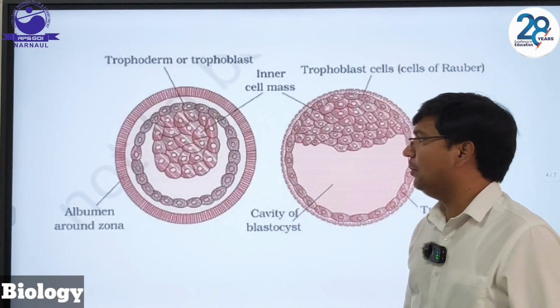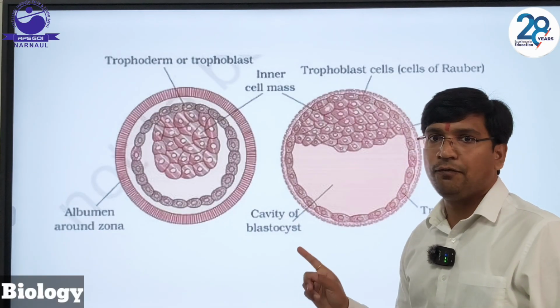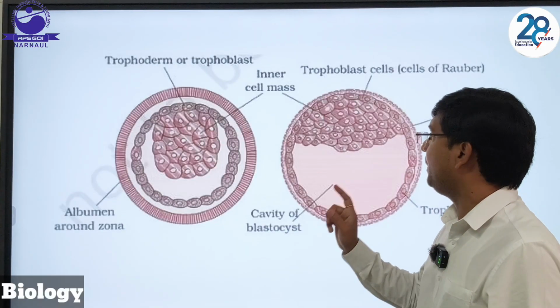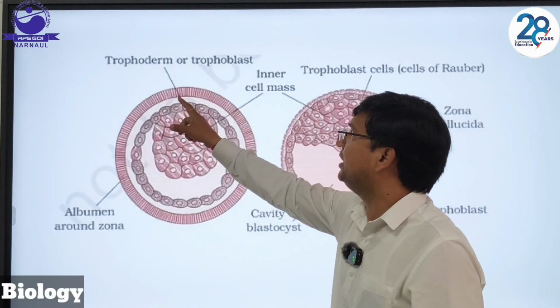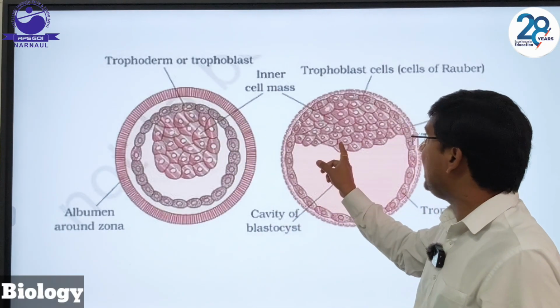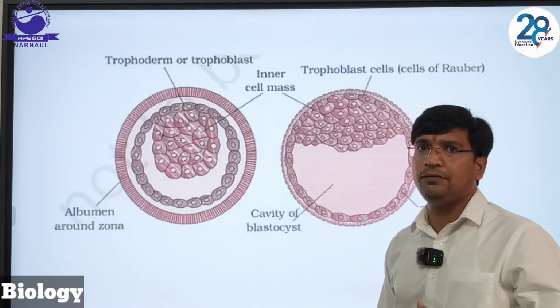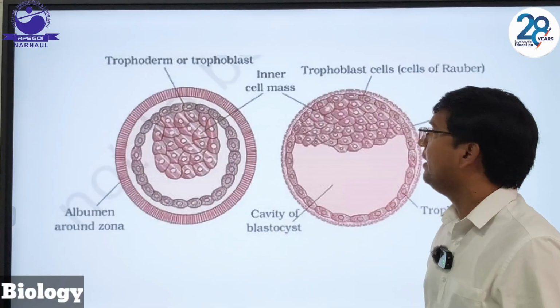transverse section of blastula. Blastula is the stage at which the 64 cell stage is arranged into two patterns. The first pattern is a layer form, known as the trophoblast or trophectoderm, and the other is the inner cell mass. Each and every cell of the inner cell mass acts as a stem cell which gives rise to the three germinal layers: ectoderm, mesoderm and endoderm.